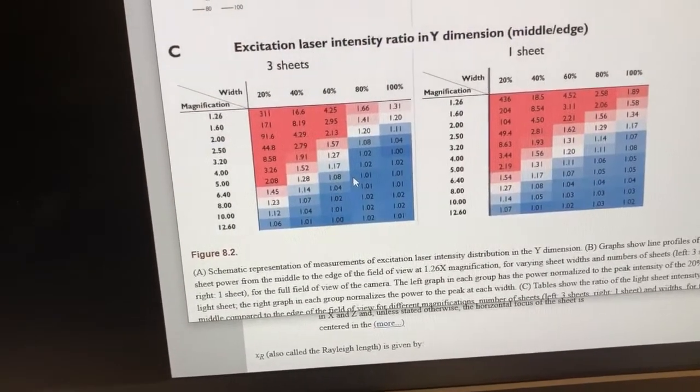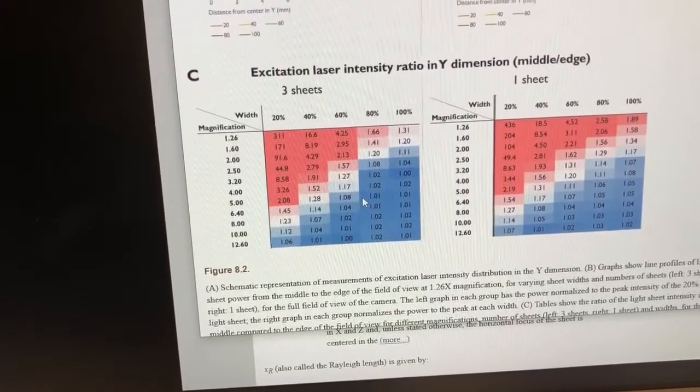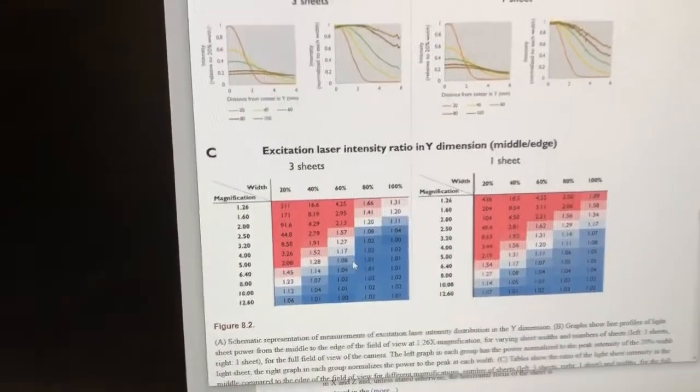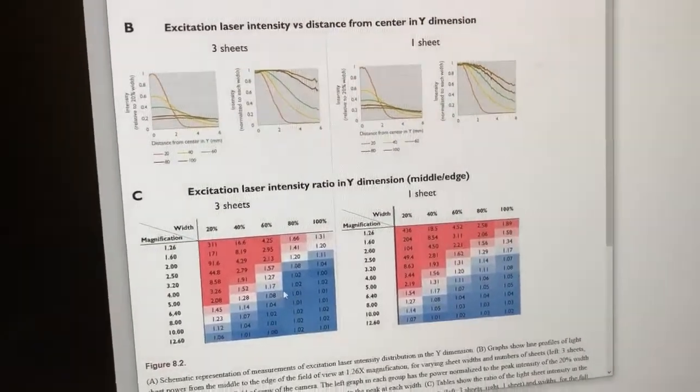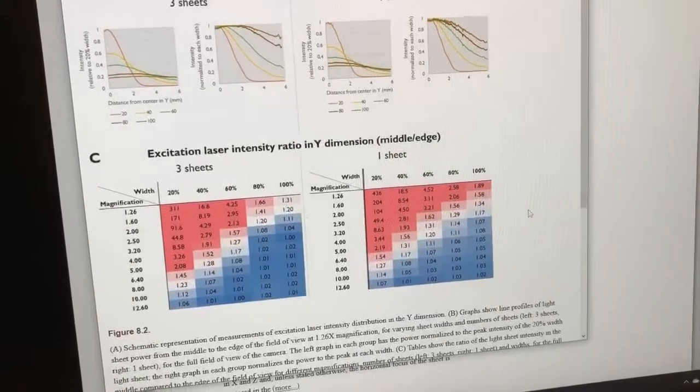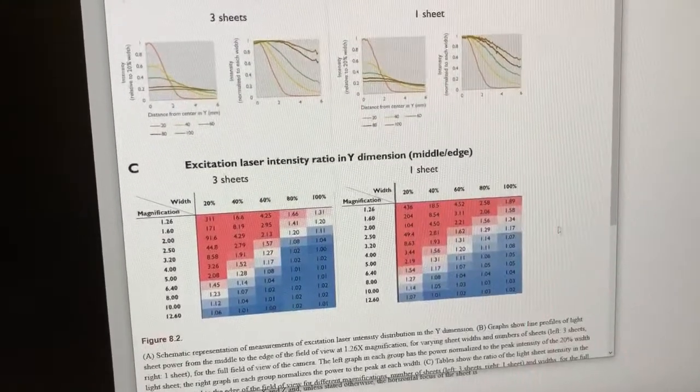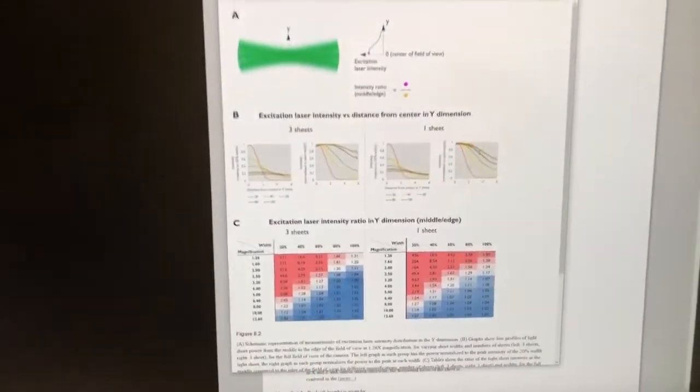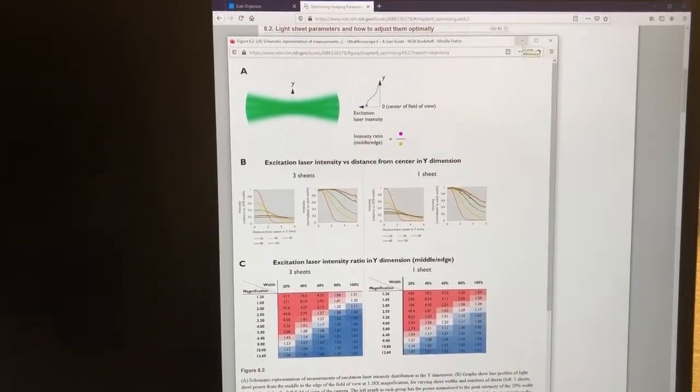So if you find that you're zooming in a lot and your sample is kind of dim, you can look at this to get a sense of how much you can reduce the width to get a little bit more power into your sample. Okay, this sample doesn't have that problem, but I thought I would point that out in case you're in a situation where you might benefit from this.